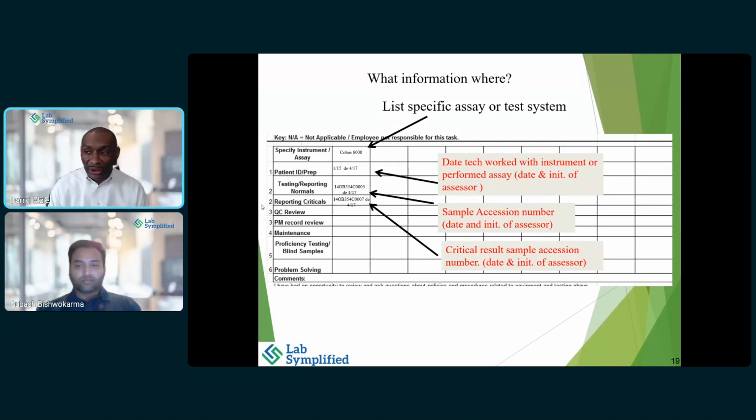As I mentioned earlier, a good inspector is not there to try to catch you on something. They want to understand that you are assured that your staff is doing competency and they know what they're doing. You understand why. Okay, we use a simulated test sample here to do this test because it's a high cost. The staff goes through every step per SOP, even though it's a simulated sample. I'm okay with that. Then I can understand that. Be prepared for that explanation and talk about it.